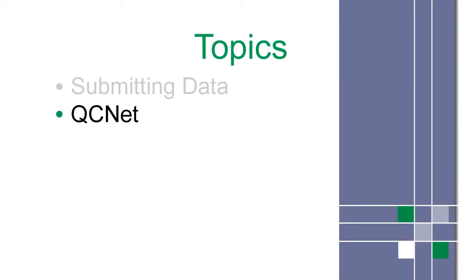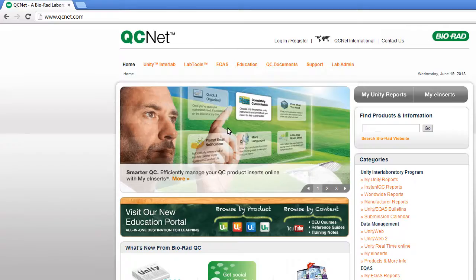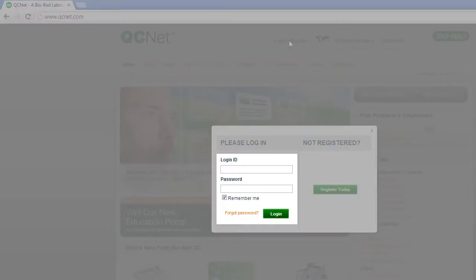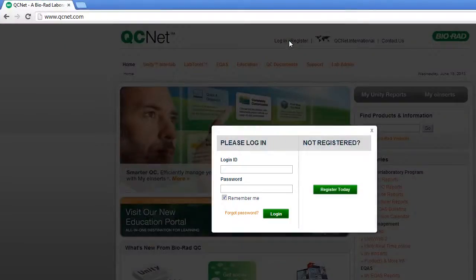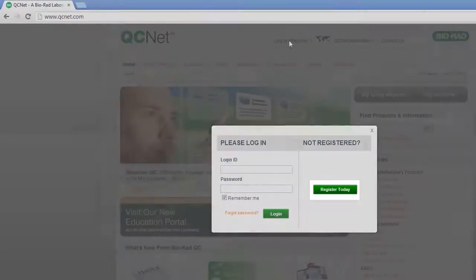In the last step, you submitted your data to the Unity Interlaboratory Program. After this data has been processed, you can access your peer reports on QCNet. First, log on. Existing users enter a login ID and password.